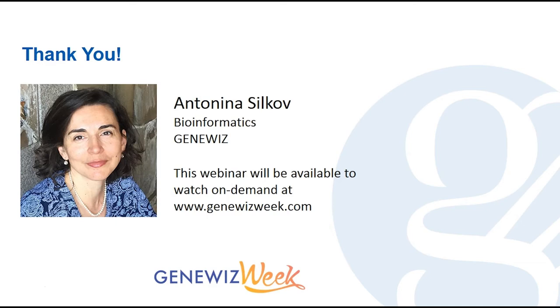One of the first questions we got is, how are the complementarity determining regions identified? As I said, complementarity determining regions are much more variable than the framework regions. So researchers are looking for the conserved sequences that can be extracted from BCR and TCR databases. One of the most popular databases related to the system is IMGT, although nowadays other databases are also being developed.